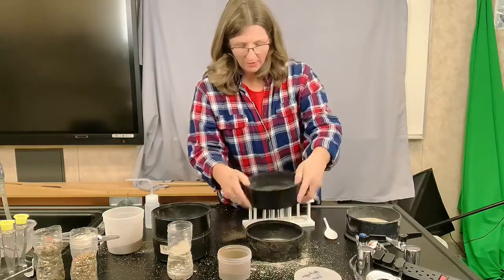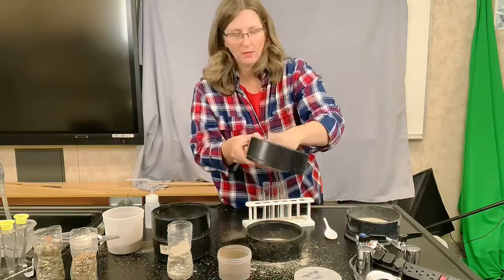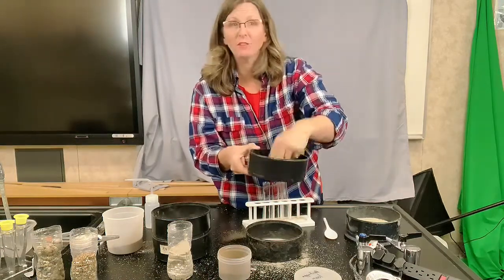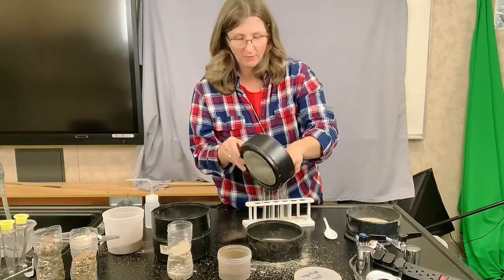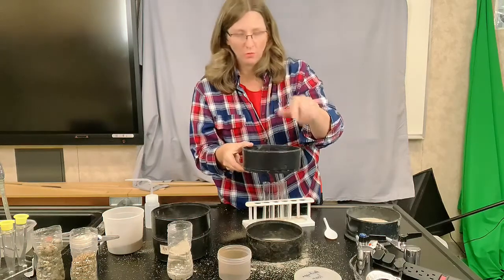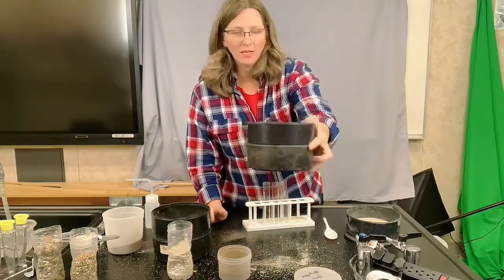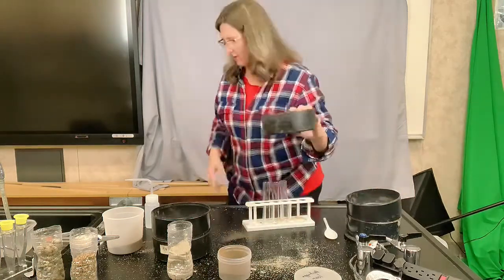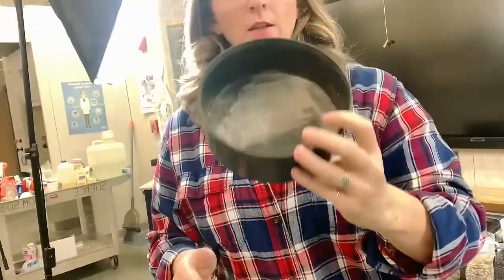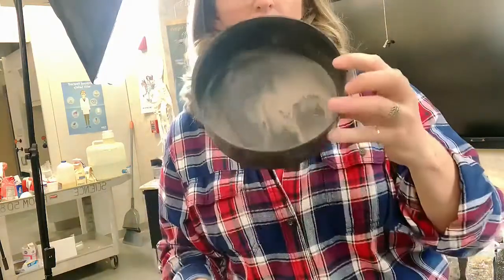So now you see this very fine sand right here. Can you see that in the lid? Probably not. It's just like a nice little powder. Like it feels almost like a powdered sugar. That's silt. So it's very, very fine and very smooth. Then in this very last tray, what it didn't look like there was going to be hardly anything, we get the clays. And the clay just looks like very fine dust. It's just super powdery. See that? So these are clays that are coming out of the soil when we sift it through the screens.